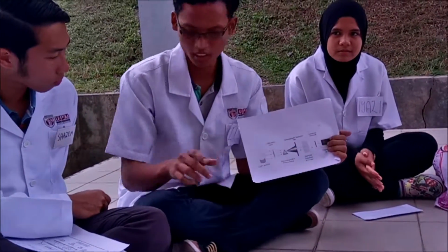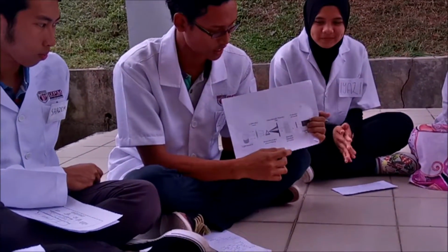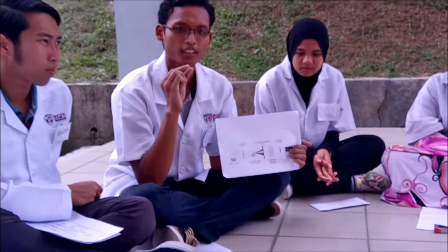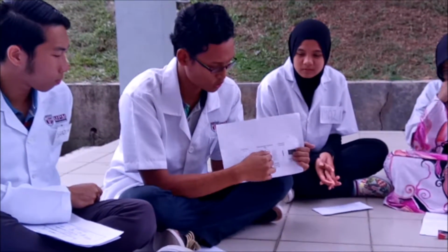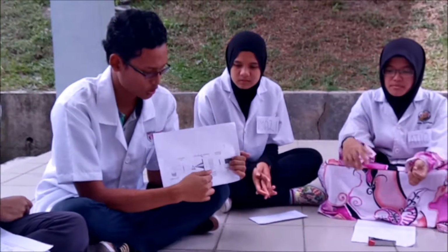So how do we control and select certain colors to be used? We have this slit. This slit is very small and narrow, so it will choose the colors that we want to use. So for example, if we want red, we can adjust it to 620 nanometers.